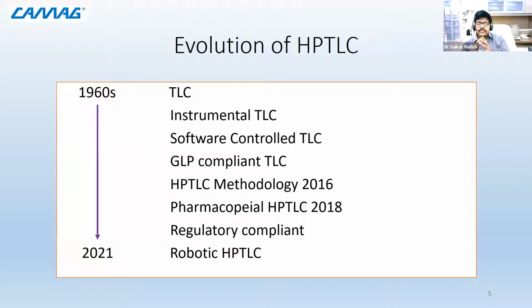Knowledge was less, the instrumentation was lower at that point of time, and so it was designed to be a benchtop technique, so that anybody could use it immediately, test it and find it out. And the concepts of reproducibility and reliability were not of much importance, because the analyst used to just test it, get the information, and the task would be over.